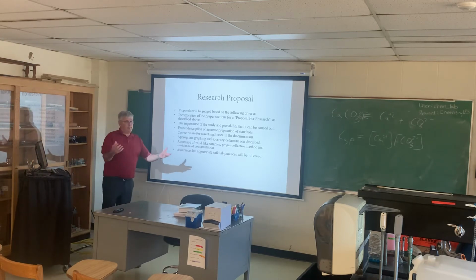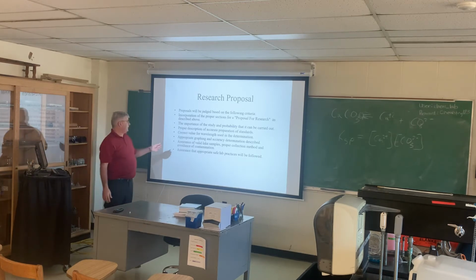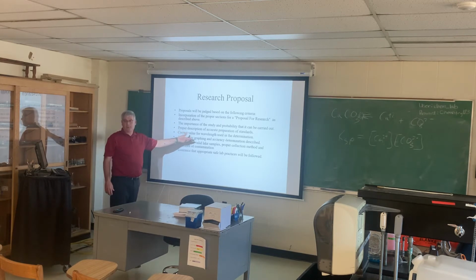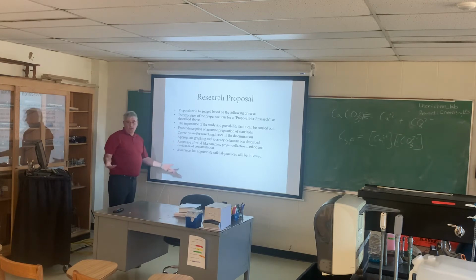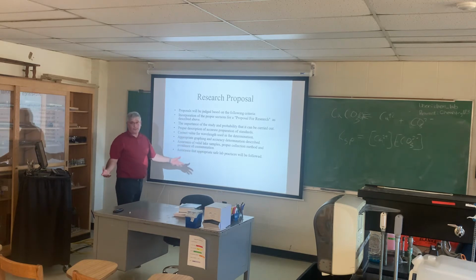When you're thinking about picking sampling locations, public access is the best place. Okay, so it's something to think about, something that's available to the general public. All right, so importance of the study. The proper description of the preparation of standards, for example. I'm going to look at that. I'm going to look to see if you actually looked for the correct wavelength during the scan or actually arrived at that. And so if the wavelength's incorrect, I might reject it. If you have appropriate information for graphing, okay? If you don't have enough detail, I'll reject it. And assurance of valid lake samples, proper collection techniques, and those types of things.